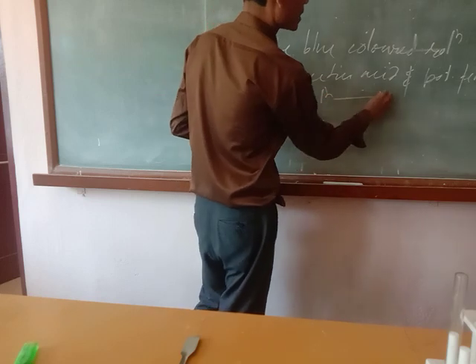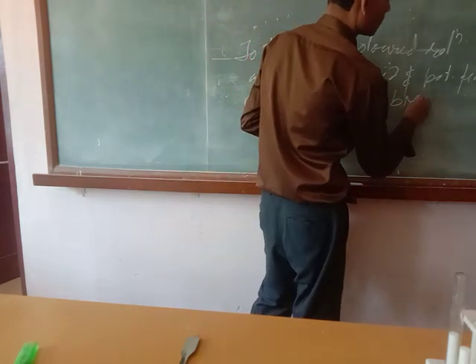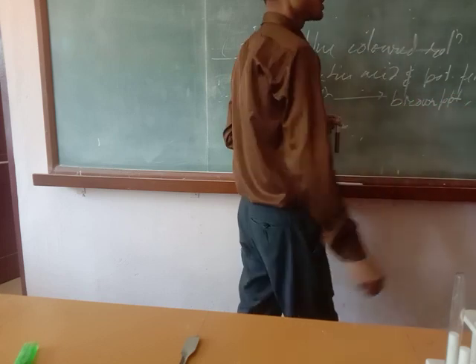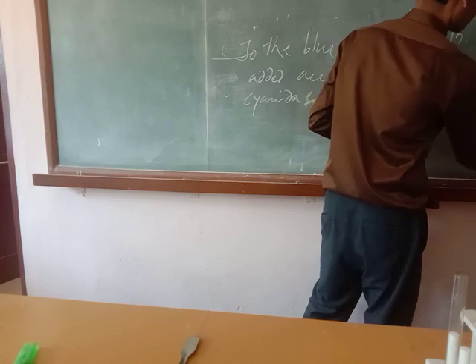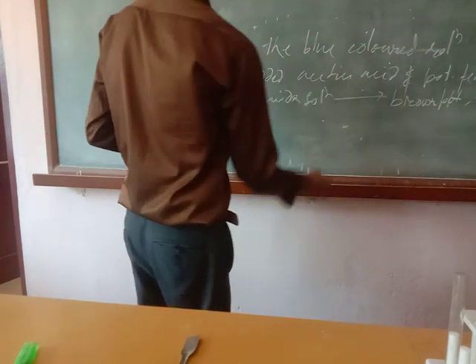Then we observe brown PPT or chocolate brown PPT. So it is the confirmatory test for copper, Cu2+. Clear?